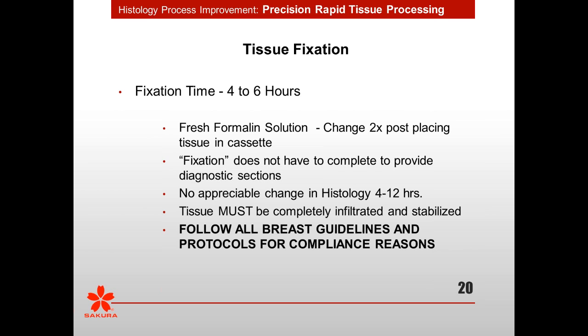If you look at ASCO-CAP, what's the minimum for your breast? It's 6 hours. It's more about being precise and keeping the hours with small variation and making sure that you get everything in the same amount of fixation and consistently. You have to have your tissue completely infiltrated and stabilized. I think that's the key part.